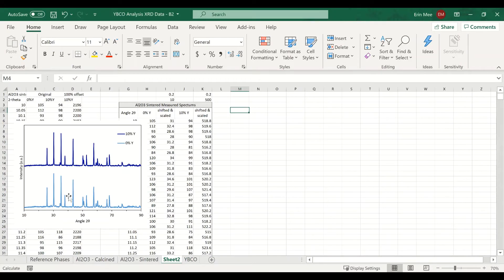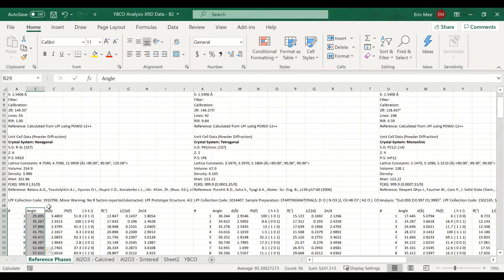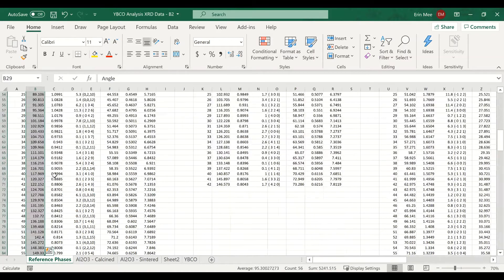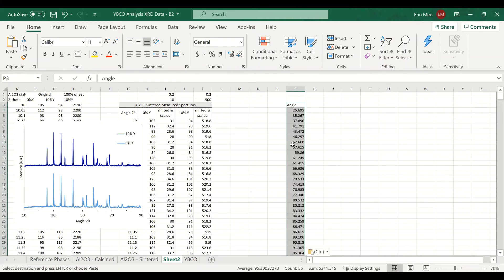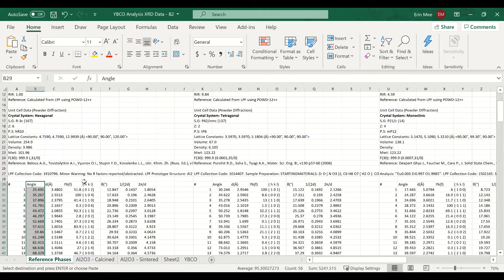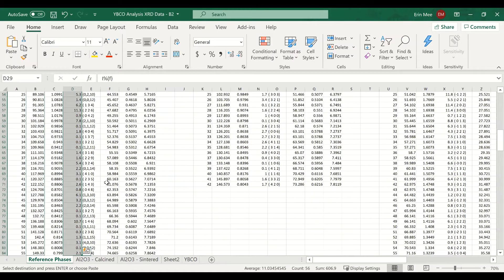Here's my data, and I'm going to grab a reference spectrum, grab the angle and the intensity, do Control+Shift+Down, and copy. So there's the angle and the intensity values.